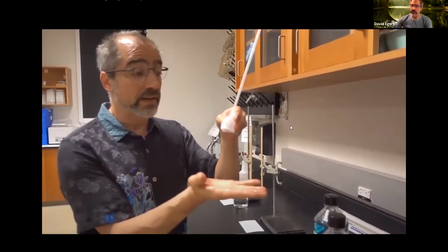I just want to reiterate, the colors are purely just so you can see stuff going up the tube. You want to ignore them in terms of osmosis or particles or anything like that. The color is purely to more easily visualize things and to make it easy to see which is the 40, which is the 20%. But the concentration of the dye molecules is so little, it's basically irrelevant in terms of osmosis.